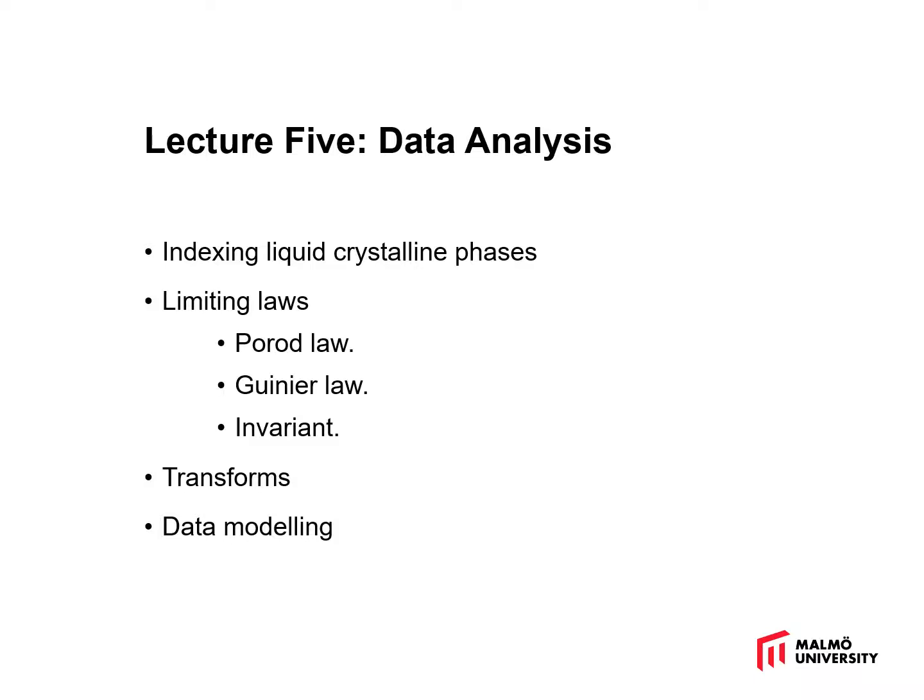Lecture 5 is about data analysis, or extracting structural information from the scattering curves. I'll talk briefly about liquid crystalline phases and indexing them. This is a very specific topic, and we'll have an example of that in the practical sessions. I'll talk about the limiting scattering laws, the Porod law, the Guinier law, and the invariant. I'll talk about direct transformation of the data into real space information, and possibly the most popular technique for analysing scattering data, data modelling.